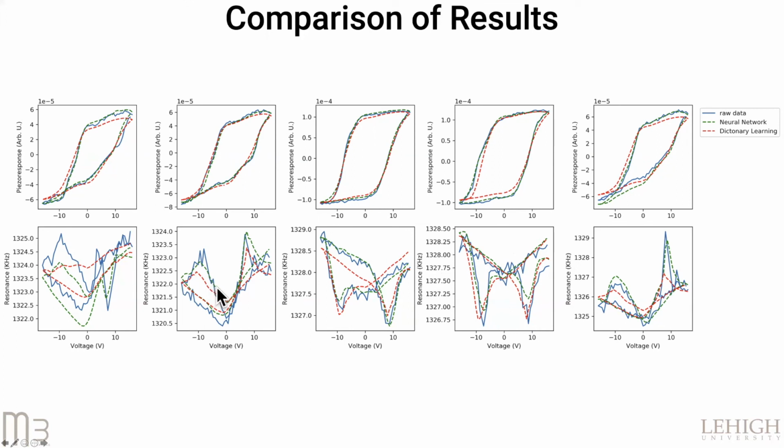And this is on top of the fact that the dictionary learning model takes the mean of each spectra and removes that from the data, so that it's actually a less challenging mathematical problem to recreate the reconstruction. So what ends up happening with the dictionary learning is it essentially just learns the general shape and average, missing out on the important key details in the spectra that are actually physically important.